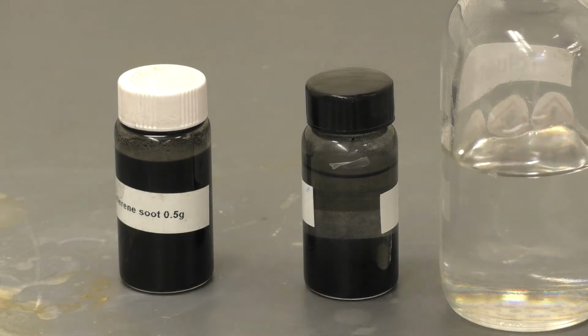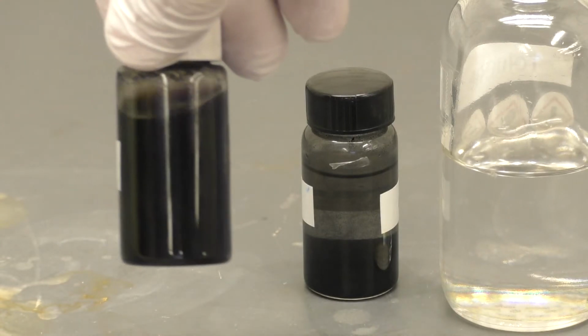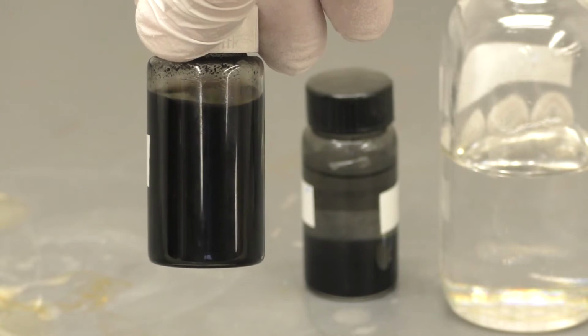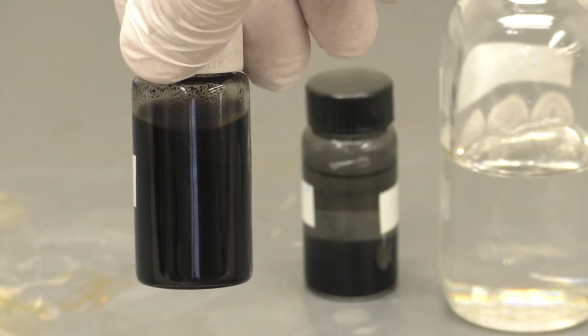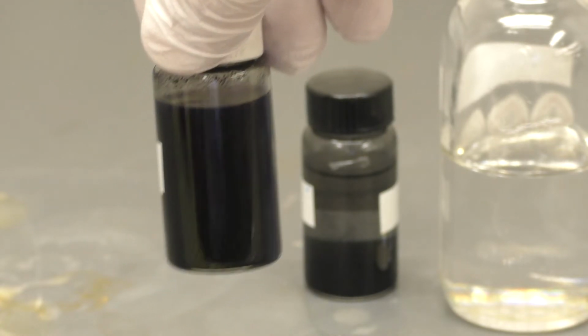But maybe we can see if we take a look at the fullerene soot. That doesn't look quite the same. It doesn't seem to be clarifying quite as well. So there must be something different about that. And what we need to do is just let this sit for a while and come back and check it at a later time and see if there's any difference.